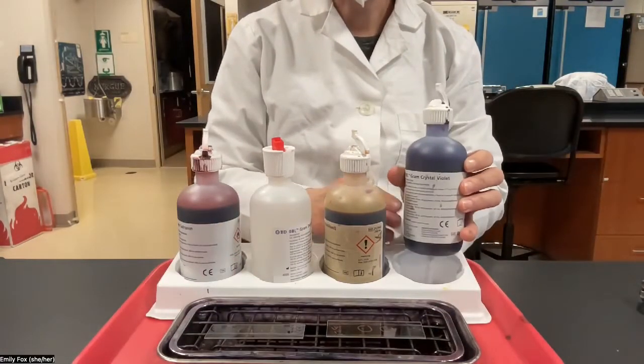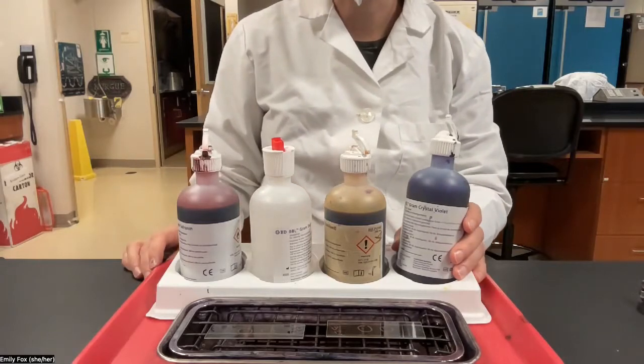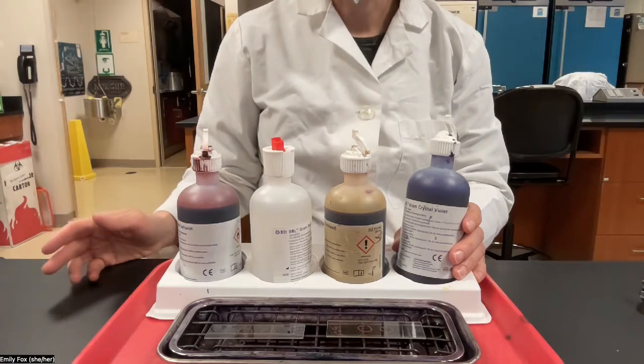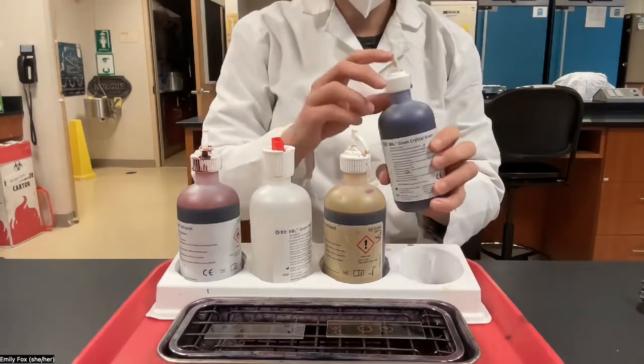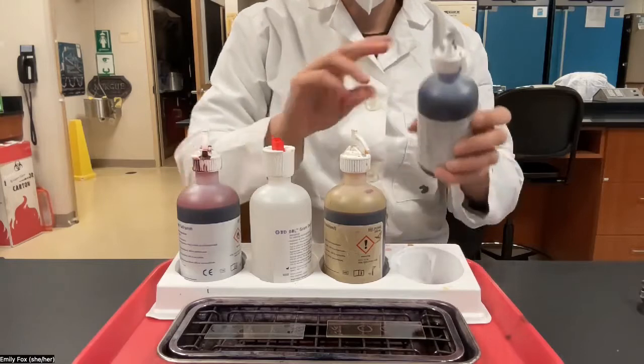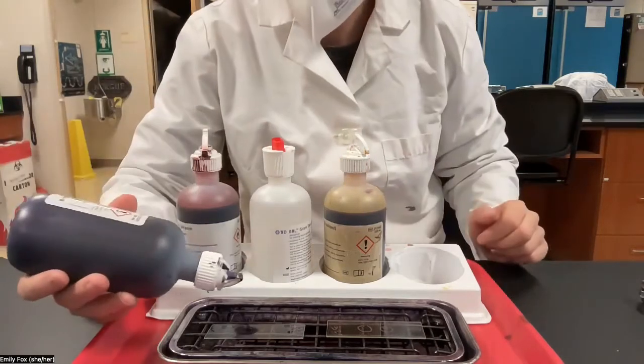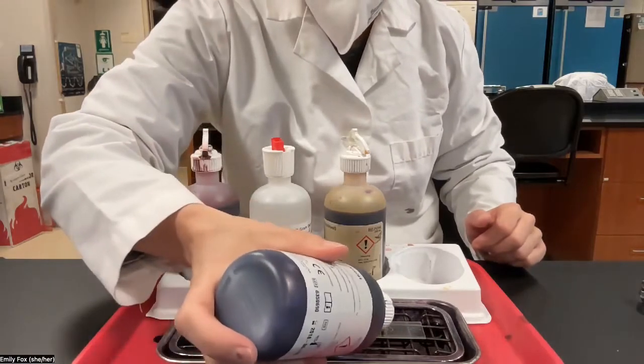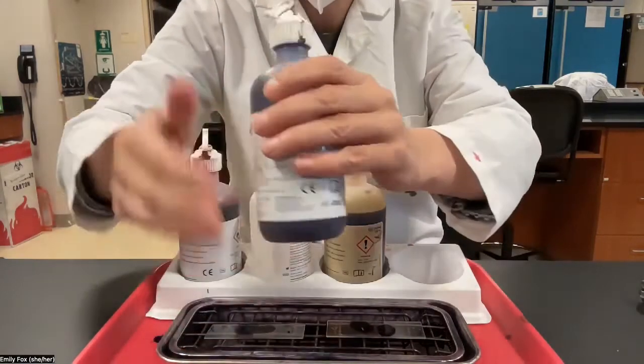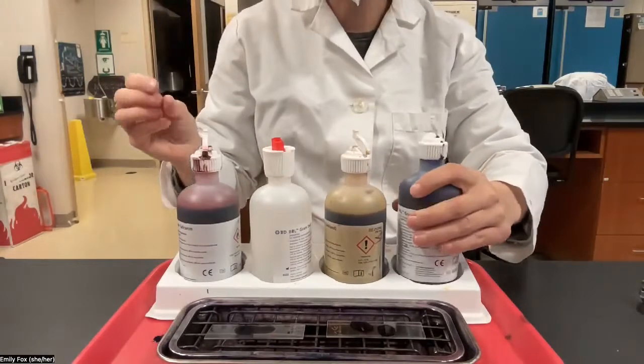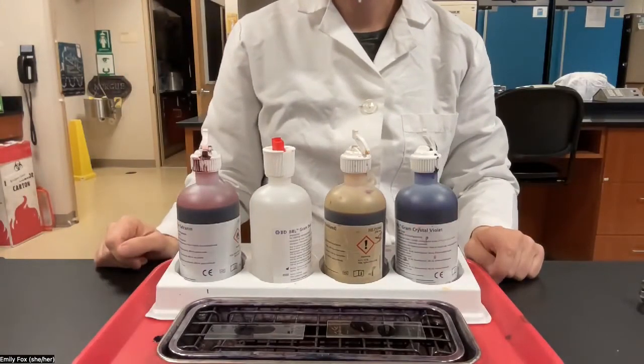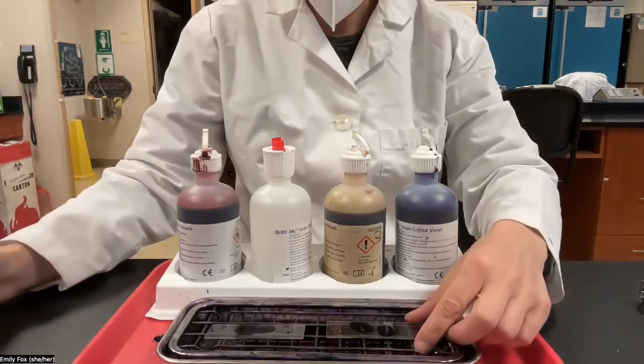I'm going to start with the crystal violet, and you're going to want to use a timer of some kind. You can either use a cell phone timer or watch the clock in the classroom. So I'm going to just make sure that I add crystal violet to both of my slides. And this is going to stain for one minute. Okay, one minute's up, time to rinse.